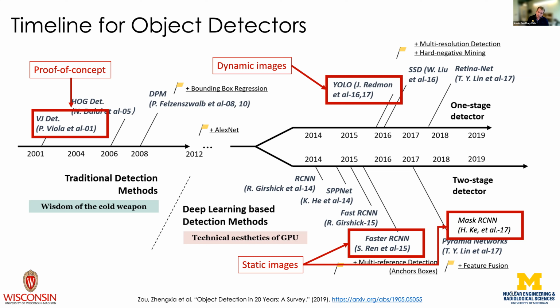And what we've been looking at and trying to apply is, does that work for microscopy? And does that work for our microscopy? And many other groups are looking at it for their microscopy as well. So I want to throw this in here because I think you would be interested. I'm only going to talk about the use of YOLO code, which means you only look once. It's an unfortunate acronym when you're trying to give a science-based talk at a conference, but we reuse the YOLO code here, but we also have data and recent papers out on the faster RCNN and mask RCNN. These run a little bit slower, they're not as lightweight, so they're not as good for in-situ video. But I'll just talk about the YOLO stuff, but happy to talk about the others if people are interested.